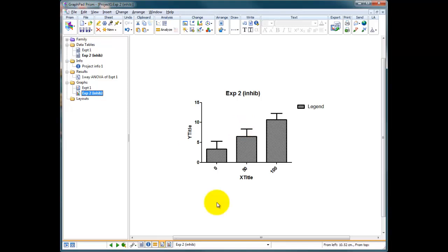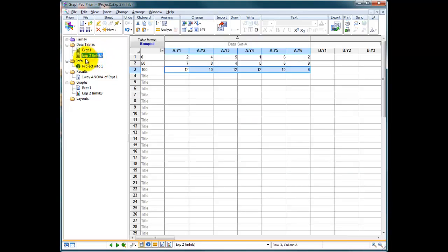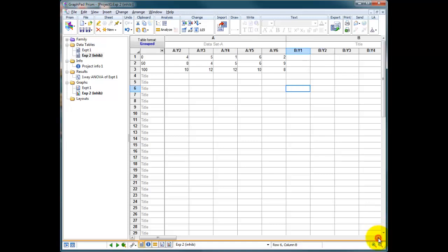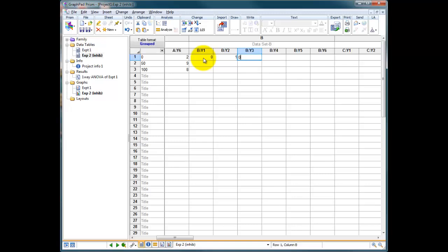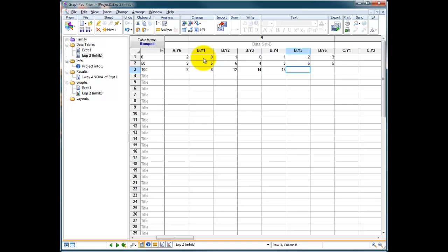Of course this graph looks terrible so we'll leave it as it is at the moment and we'll come back to that in a second. I'm just going to enter some random numbers as if I've added an inhibitor to these. I've no idea what I'm measuring here. I'm just going to add some numbers so the inhibitor inhibits whatever it is that we've measured. So there we are, there's some numbers.